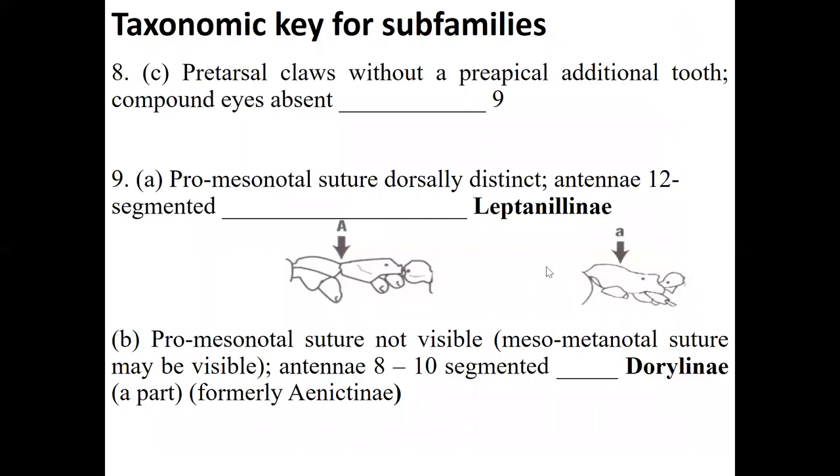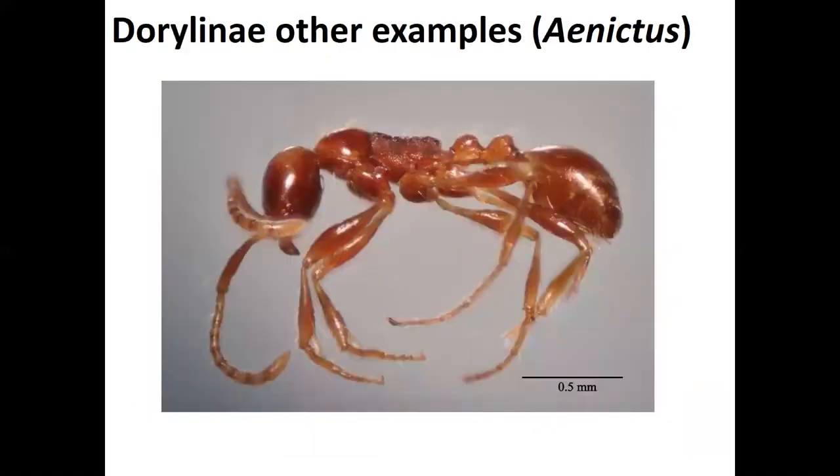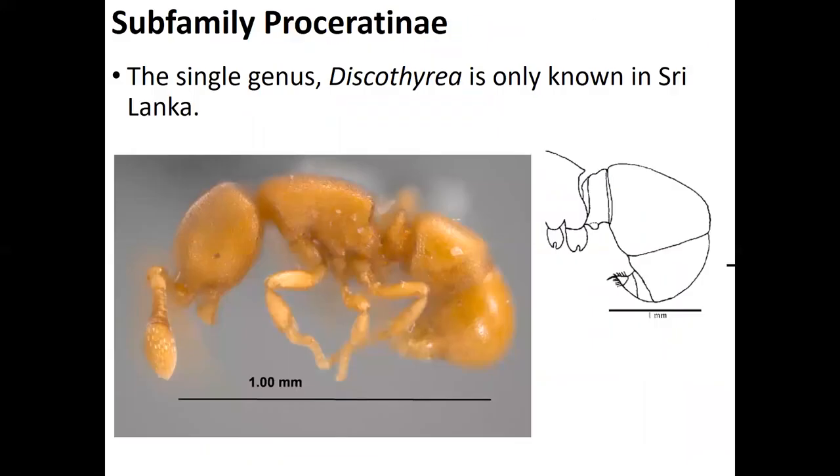Actually, in drawings or illustrations or images, it's not possible to show you what I mean. So the only thing is you have to keep the specimen on the stage of a low power stereo microscope, dorsal side up. In this sort of view, you can't see that feature very accurately.